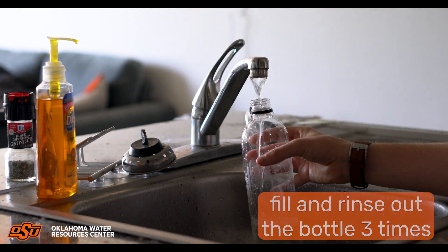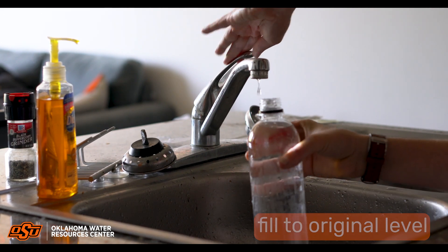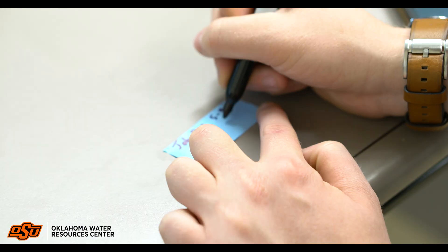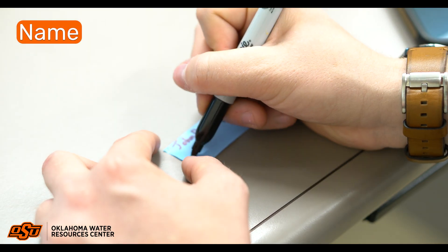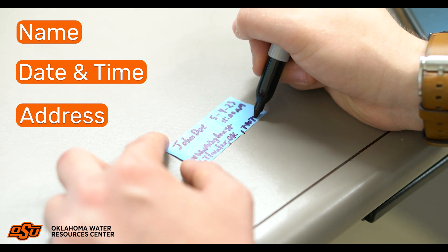Repeat the rinsing procedure twice. After rinsing three times, fill the water bottle to the level of water when first opened. Write your full name, date and time of the collection, as well as the address from which the sample was collected on your sample bottle.